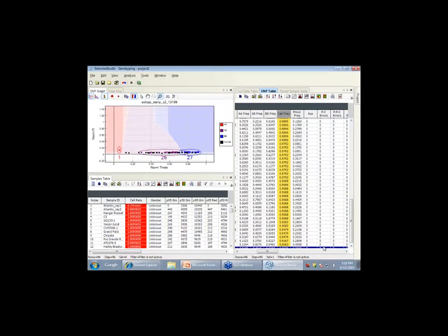Call frequency means that in your reference clone, it called it 100% of the reference clone. Is that correct? No, not the reference; it's looking at all the data that you've loaded here. In this case, there's 96 samples. It called only half of those samples in this SNP, 56%. So the call frequency is very high overall. You notice that there's one at 56%. The rest are 90 and above, so it's able to make a call. But you can change that by playing with those clusters like we did. You can exclude or include samples.